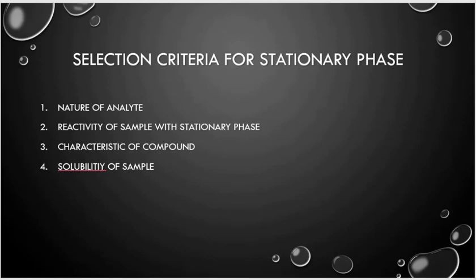Then there are the characteristics of the compounds. We have to study all the characteristics of the compounds, then we have to select the stationary phase. Then the solubility of the sample, whether the sample is soluble or insoluble in the stationary phase.